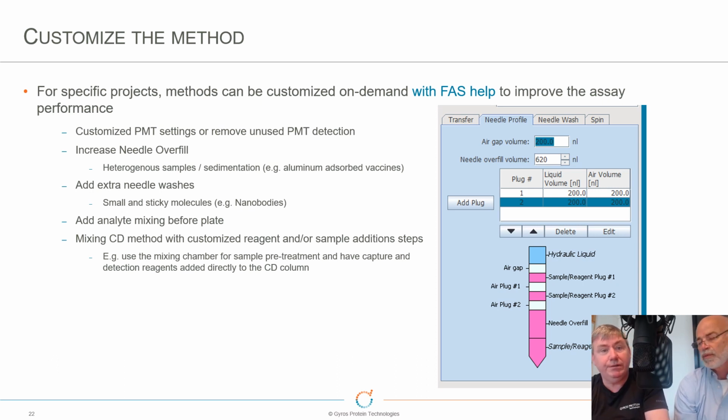Yeah, it's one of those that we've seen with a specific analyte where there was non-homogeneity of the sample from the time the plate was produced and it sat in the instrument for a period of time, and then you see that things are starting to settle out into the bottom, and you get this replicate variability that was difficult to solve until you did this mixing step.